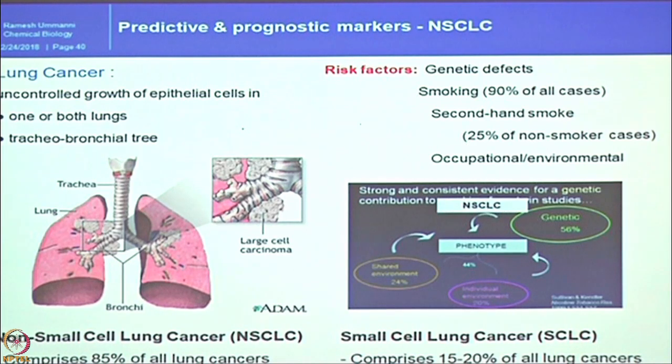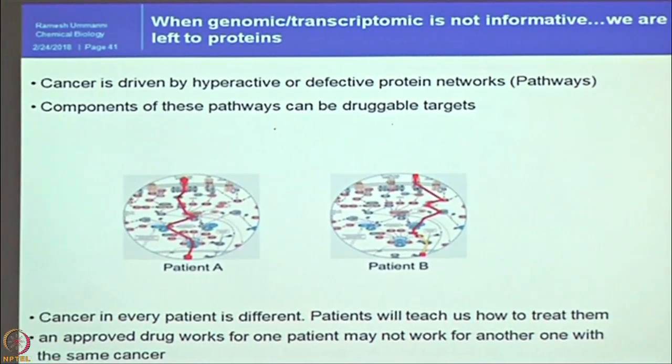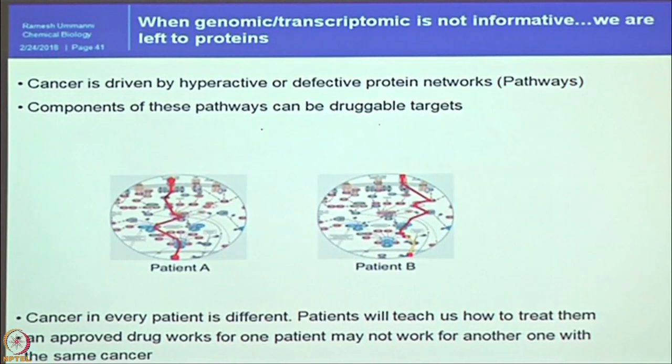Now in the clinic, even doctors are not able to segregate them before starting the treatment. So what kind of drug is good to give to them? Keeping that in mind, we tried to do some good experiments on how we can separate the patients based on their molecular subtypes using the RPPA approach. I will show only one or two examples of why it is required.